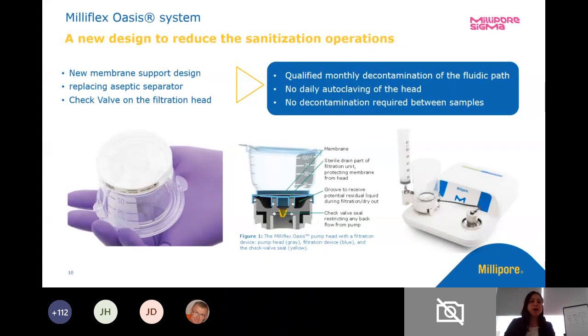We also have a disinfectant accessory that can come with our pumps. It supports membrane disinfection and if we want to disinfect the inside and internal workings of the pump, we do have a qualified monthly decontamination unit. We've done some studies on it — we have a poster we'd be happy to send that we presented at the PDA last year on the disinfection and how we validated that monthly qualification. You can still autoclave the pump head, but if you're keeping it in your laminar flow hood, there are other things you can do.